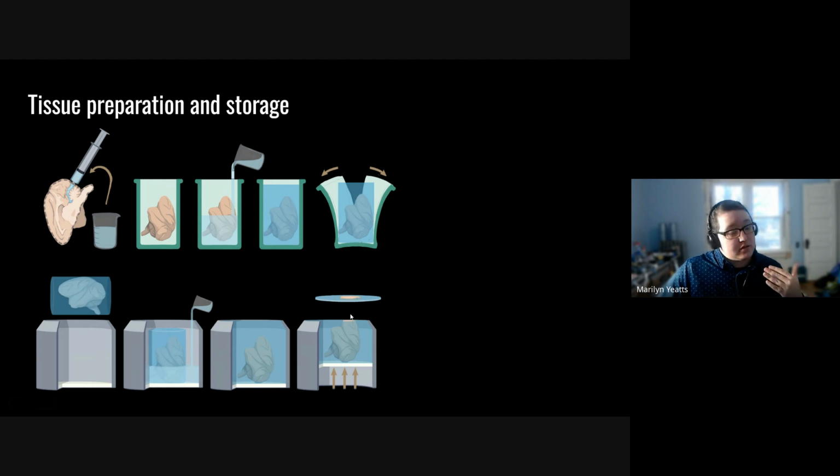And the way that PS-OCT works is it does look in depth, but it can only see down about a half a millimeter. And I section at about 200 microns to make sure that I don't have strong decay between my sections for reconstructive purposes later.